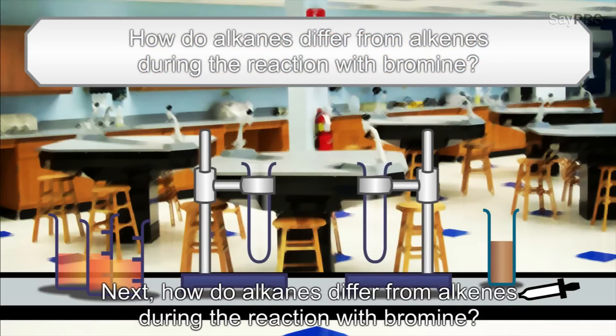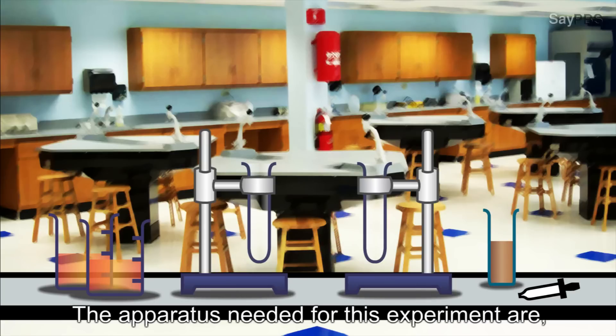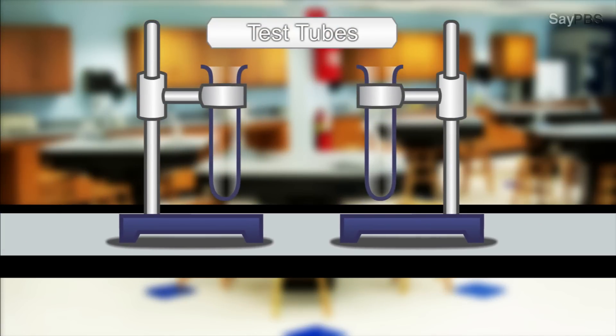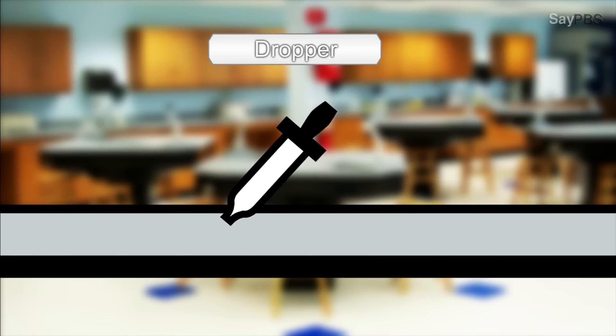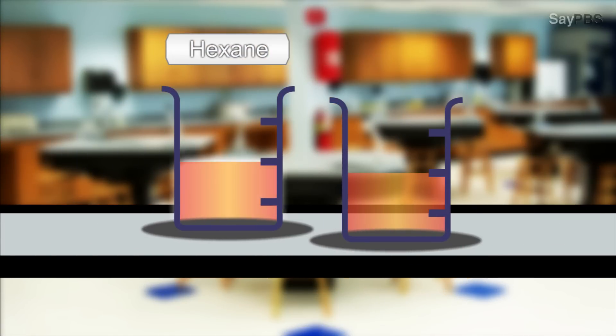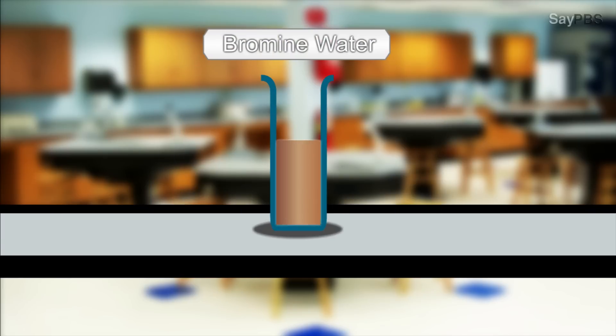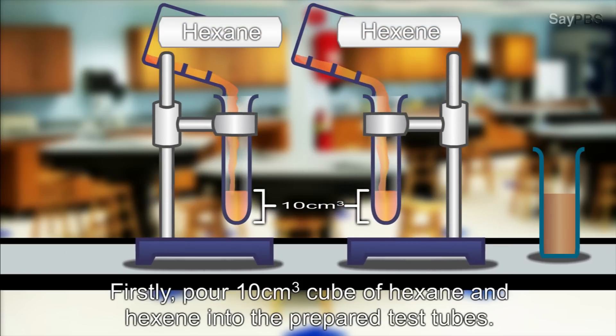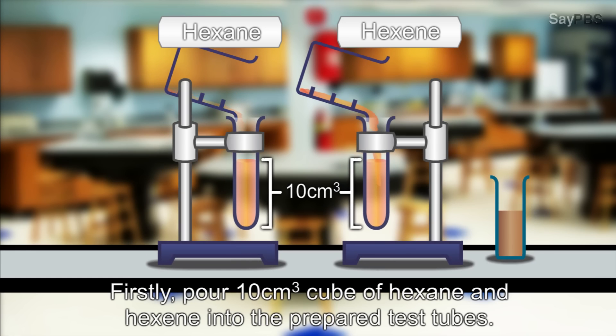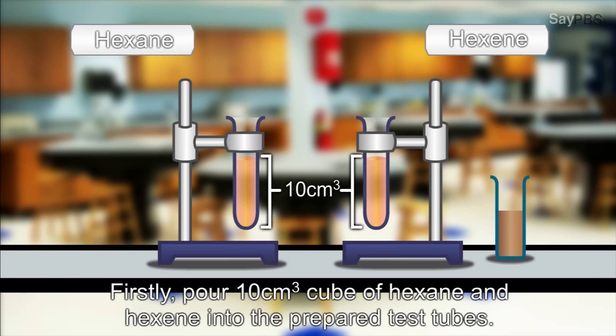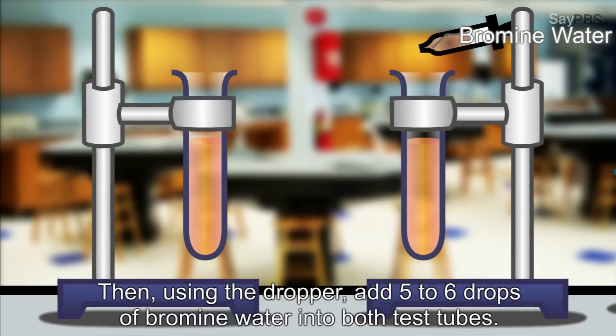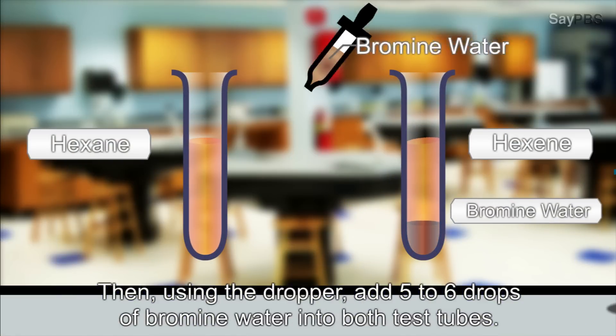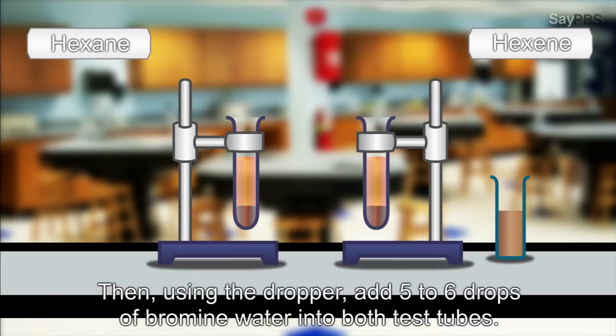Next, how do alkanes differ from alkenes during the reaction with bromine? The apparatus needed for this experiment are test tubes, dropper, hexane, hexene and bromine water. Firstly, pour 10 cubic centimeters of hexane and hexene into the prepared test tubes. Then, using the dropper, add 5-6 drops of bromine water into both test tubes.